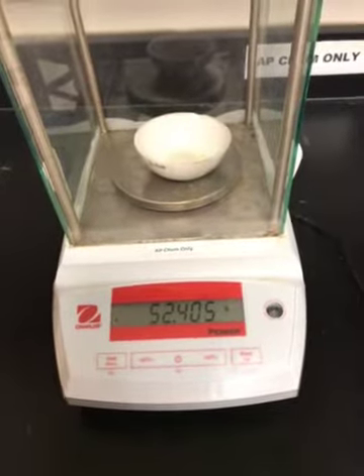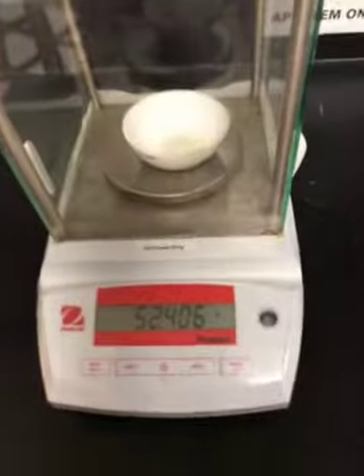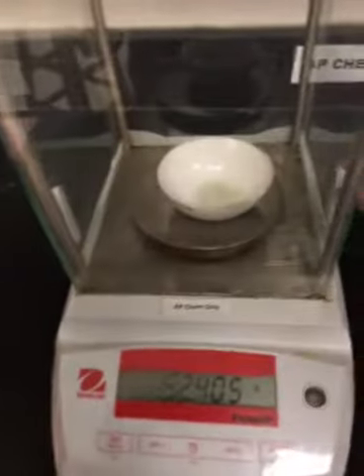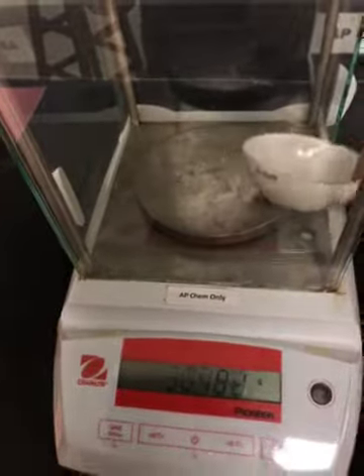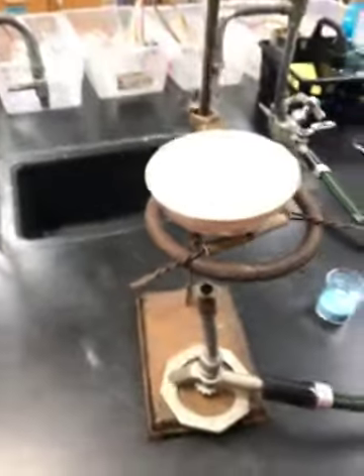And if we were in class and limited on time, we would just be done with the lab. But if you were doing this in college, you would actually keep heating it and cooling it until you get a consistent mass to make sure that you've driven off all the water. So what I'm going to do is I'm going to go ahead and heat it again for 5 minutes, let it cool for 5 minutes, and then we're going to remass it.